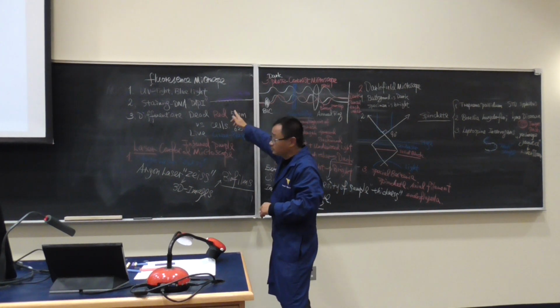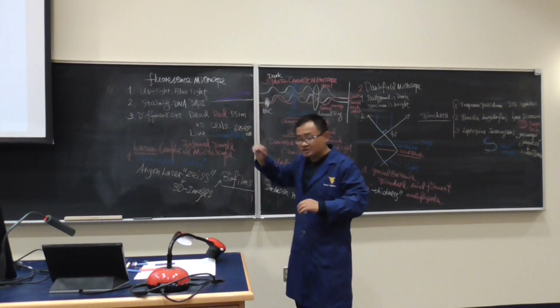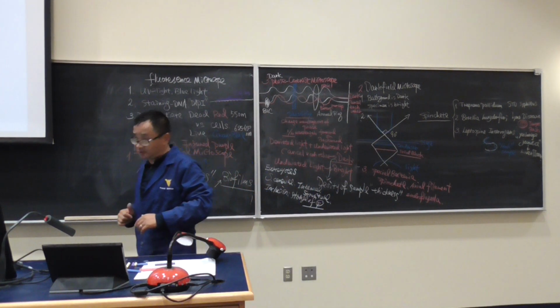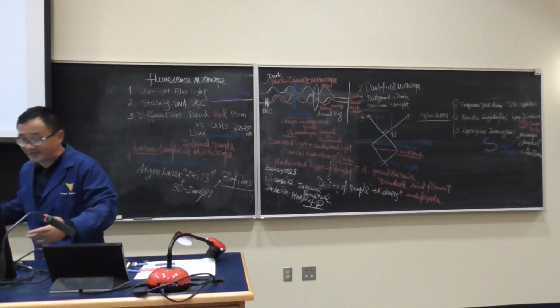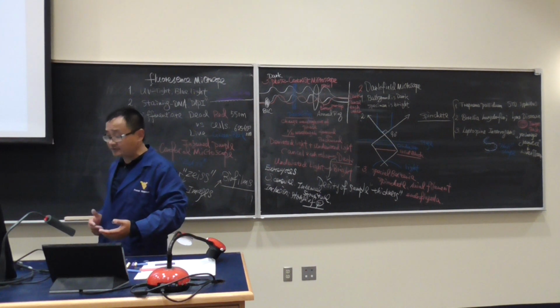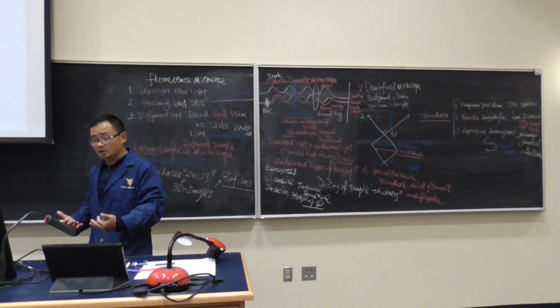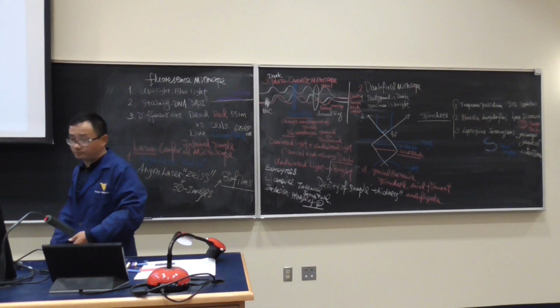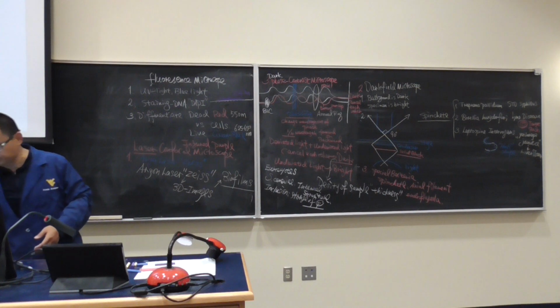But the biofilm left on the surface, they stack together, become a layer, and it's resistant to those sanitizers. So we have to do the analysis. And we also have to use surfactants to see whether it helps the traditional sanitizer. So this is just to show you an example for the laser confocal microscope. Okay?